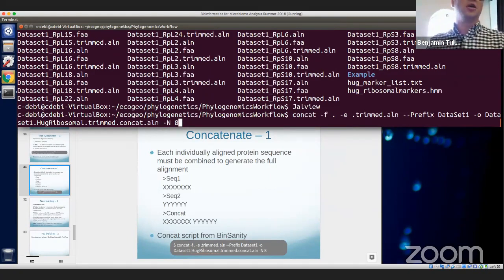If you're working with closed genomes, maybe you got them from a source and you can't trust all of the outputs, you might want to have a really high number here. Maybe you want 15 of the 16 or 16 of the 16 to be present because you're supposed to have them all because they're closed. If you're working with really incomplete metagenomic bins, something in the order of 30% or 40% complete, you might be a little bit more forgiving about which markers it has and doesn't have, and you can make it a little lower, maybe 8, maybe 6 or 4, something like that. It will impact the tree, but it will still give you some information about where those organisms are on the tree that you're working with.